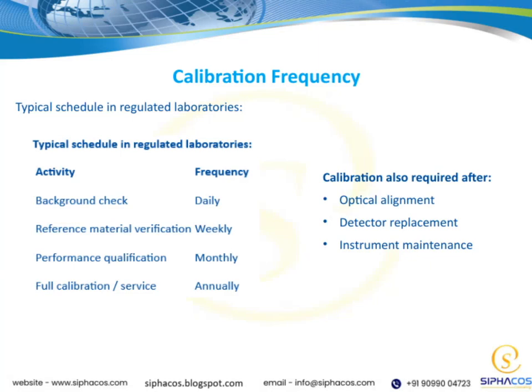Now, it's important to remember that calibration isn't a one-and-done task. It also needs to be performed after certain key events, such as optical alignment, detector replacement, or any maintenance work on the instrument. These activities can affect the instrument's accuracy, so recalibration helps ensure everything remains precise.